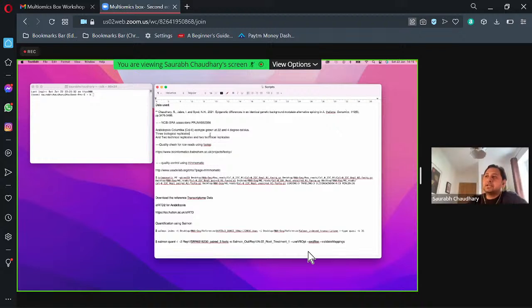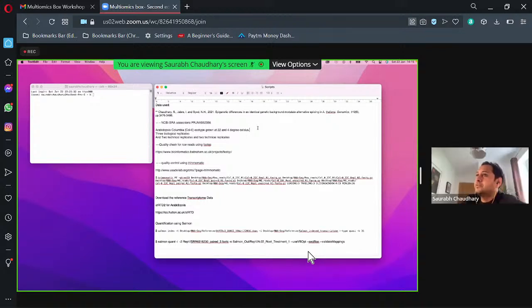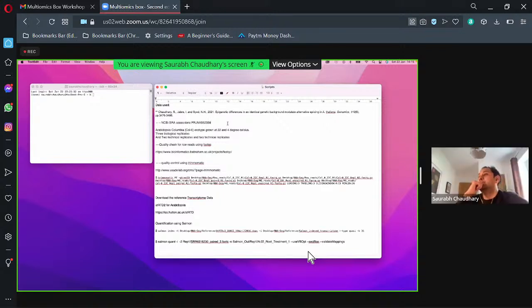Each line has 3 biological replicates and technical replicates. Sir, for any other heading? Because we are getting other sequences. If you keep searching, you will find RNA-seq as well. So there are a number of data on this. That's the study: RNA-seq of plants grown at cold temperature, yes, cold as well as normal.